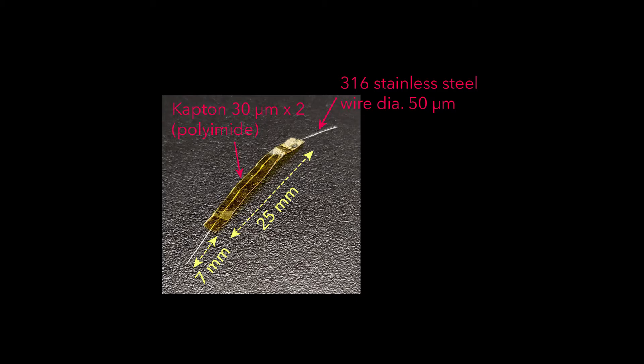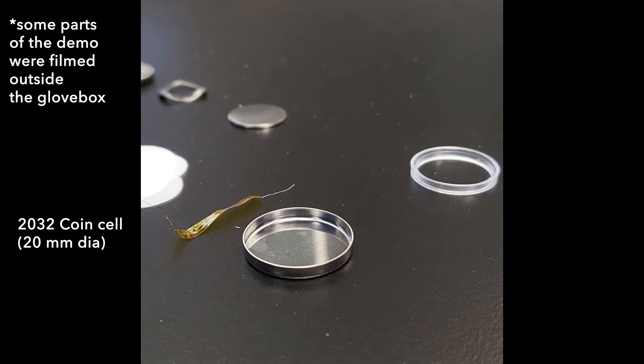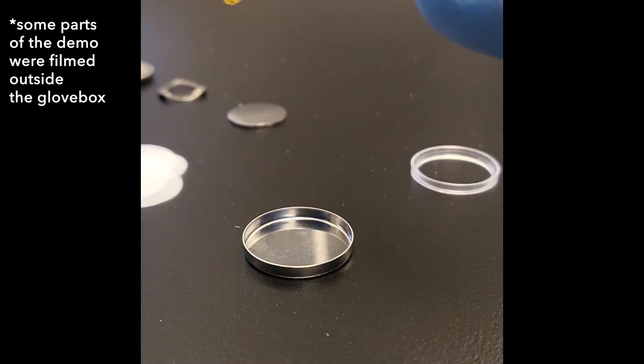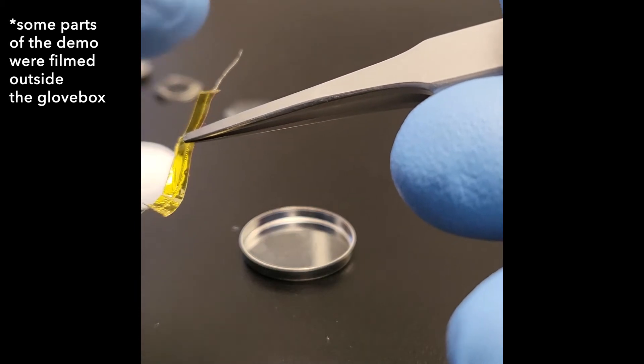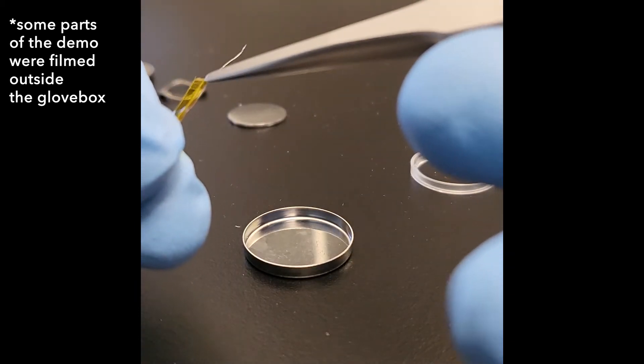If all of these parts are prepared, we're now ready to do the assembly. This assembly method places the positive cap on the bottom and works all the way up to the negative electrode. Before the assembly, we should shape the stainless steel wire into a convenient shape. One end of the exposed wire is going to contact the mesh inside the cell, and the other end is going to be outside the cell.